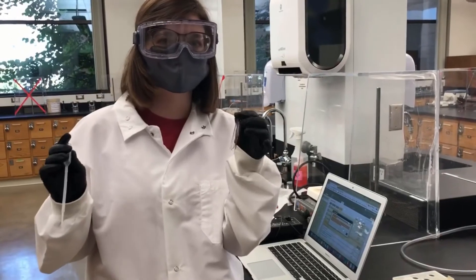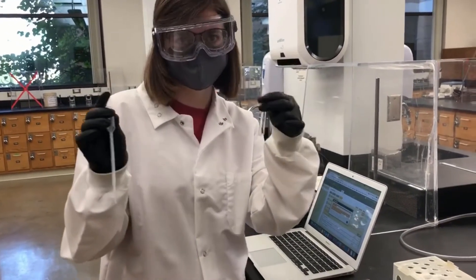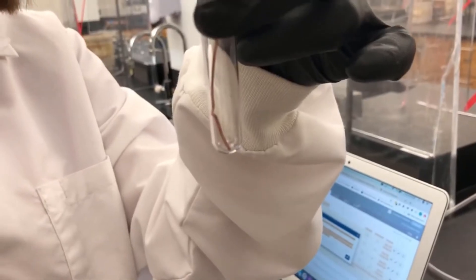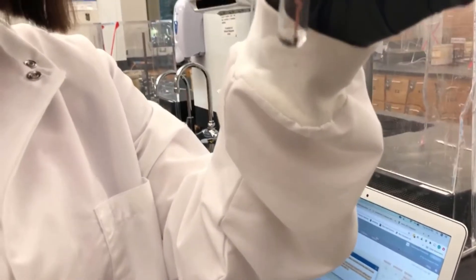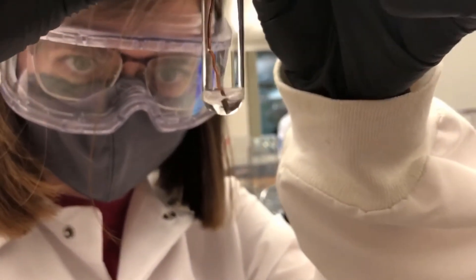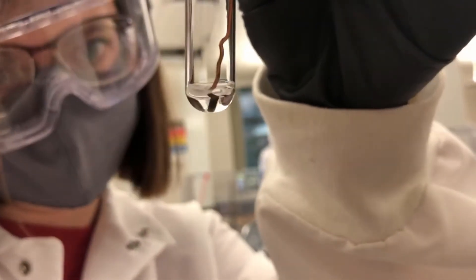This is test four from experiment five. We've got a copper strip in this, and we are going to add some silver nitrate, just enough to react. You can kind of see there is already starting to be some buildup, and it will just keep increasing as we let it sit for longer.